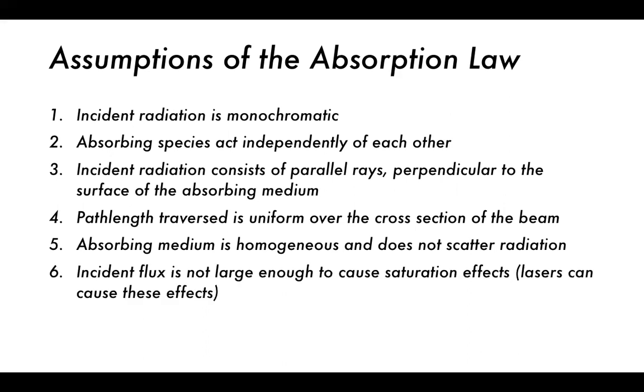Incident flux is not large enough to cause saturation effects. Lasers can usually cause these effects. So what does this mean? It means that we're not saturating the sample with energy from our electromagnetic radiation. We shouldn't be overwhelming it with too much energy, which could cause destruction of our material, which would affect the final result of our absorption measurements. We should also not have a lot of change in the energy incident on our sample. There should be a consistency of the energy transferred from the light source to the sample itself.